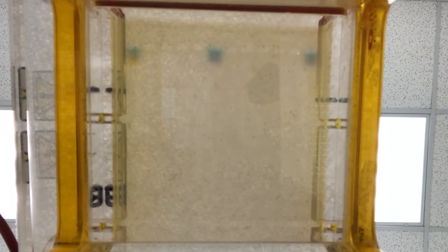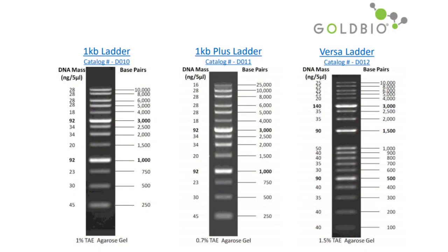I ran the gel until the loading dye was about three quarters away from the end of the gel. This is a time lapse video showing the ladders running down the gel. Here are the final images we took under UV light. The fragment sizes are labeled so you can decide which ladder will best suit your project.